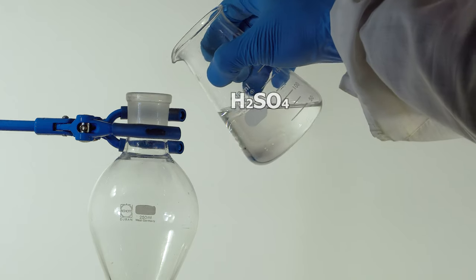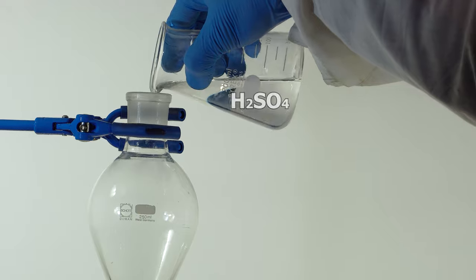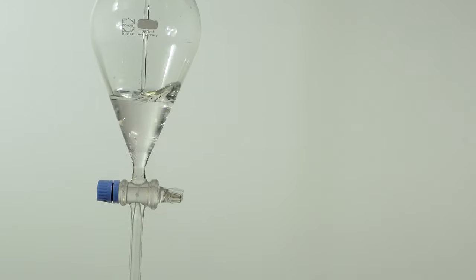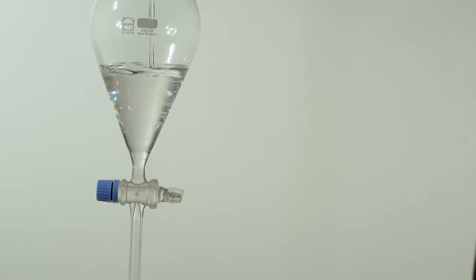To get lead tetrachloride, we add these crystals portion-wise with stirring in concentrated sulfuric acid poured into a separatory funnel.